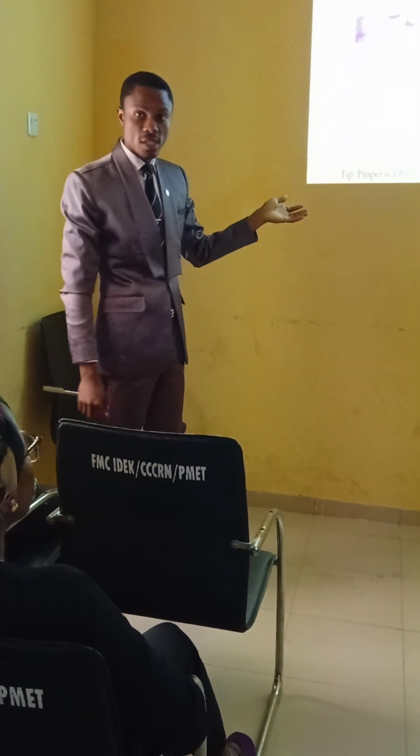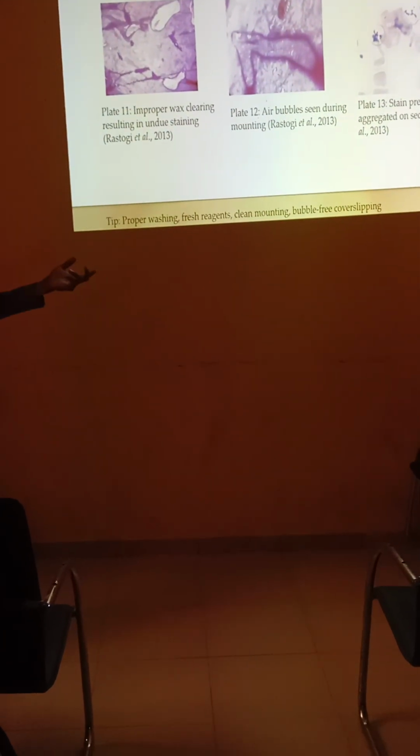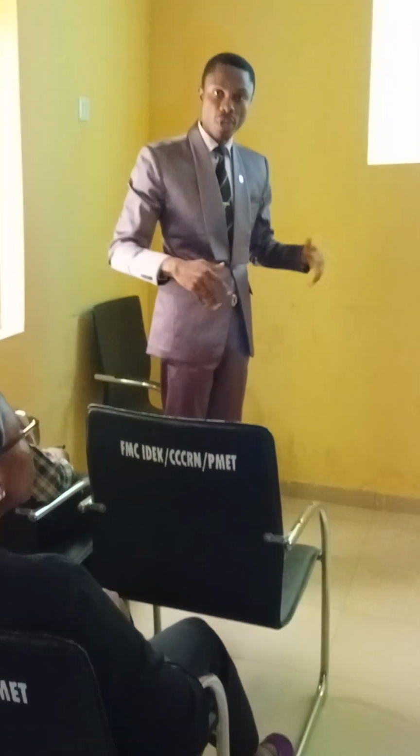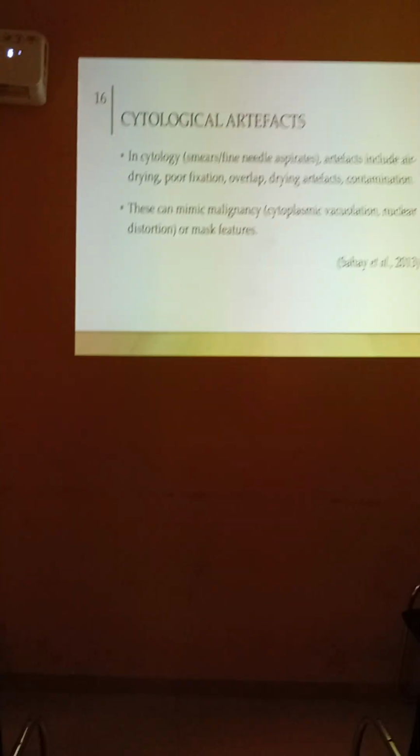So proper washing is important during staining to avoid some of these artifacts, and then fresh reagent should be used. Clean mounting, and then during the cover slipping, you try to avoid every possible error. The next one. Proper dewaxing. Proper dewaxing. Yes. Thank you very much.